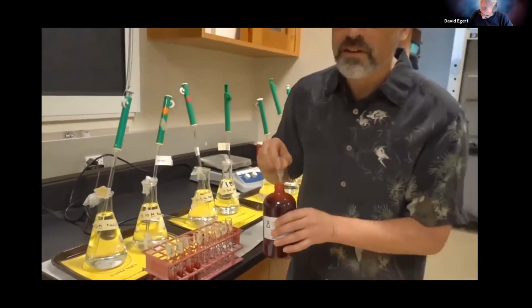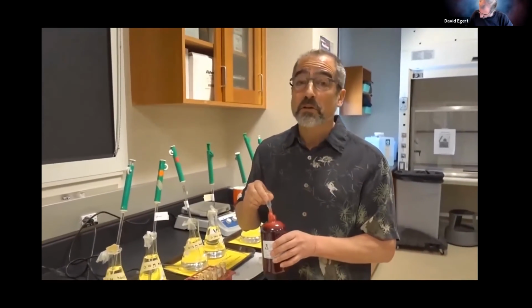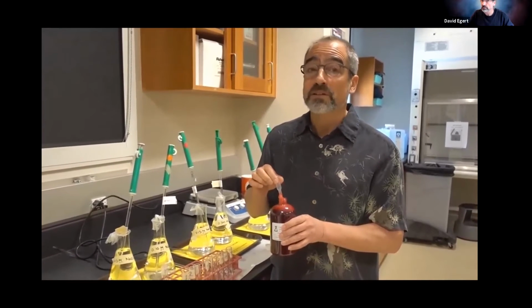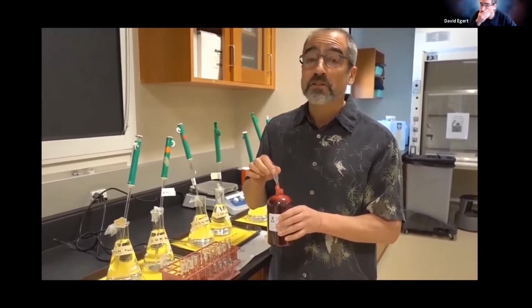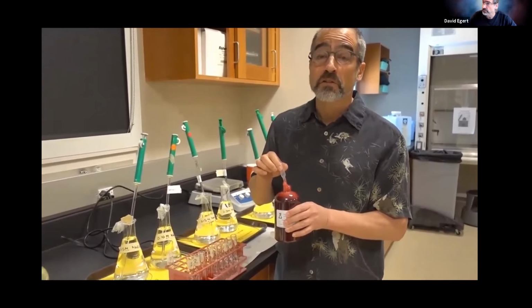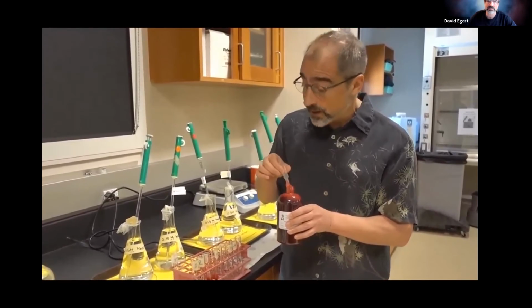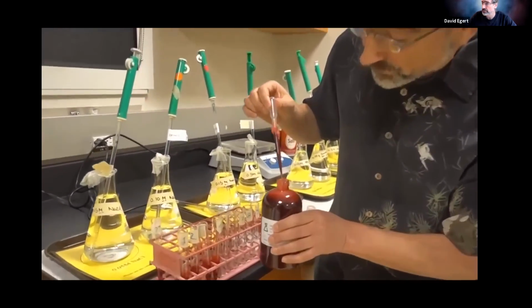Should also mention, this is cow blood, so we don't worry about the safety as much. But if this was human blood, obviously we would be very concerned about safety and be using universal precautions and all that.